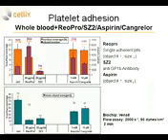We also had a look at a comparison of control samples against ReoPro, aspirin, Cangrelor, and anti-GP1B antibody, which all show the familiar effects which are proven in the literature. As for ReoPro, you can only see single platelets, object number increases, and size is decreasing. In the case of anti-GP1B antibody, you can see both the surface coverage decreasing and object size decreasing. In the case of aspirin, you have increased object number, but the size is decreased.